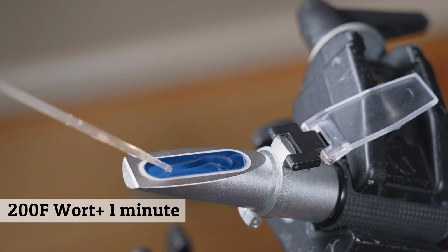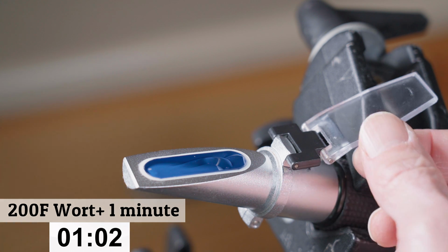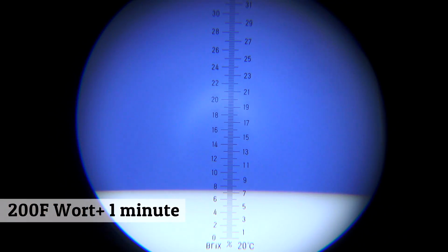So I'm interjecting a third method here. This is going to just see the result of leaving the wort on the platter for 1 minute out in the open. You could say that this would allow the sample to cool on its own to room temperature, as opposed to cooling a larger sample in that little stainless steel measuring cup. And just as a reference, I thought I'd throw this in here to show any signs of evaporation, see how that affects the readings. And we can see that the reading came in a little bit higher than the other examples. So I would say leaving the wort on the platter is not a good approach to get accurate readings with your refractometer.